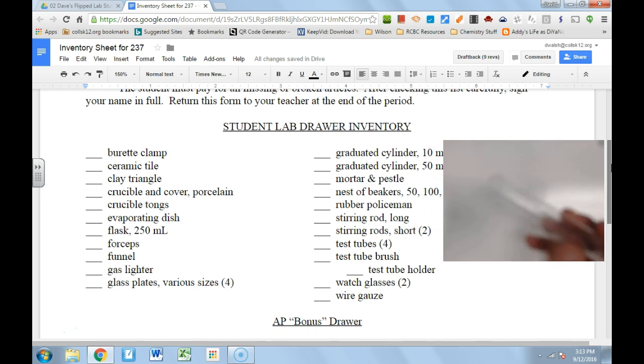These are test tubes — you guys probably know what a test tube is. They come in different sizes. This is the only piece of equipment you can intentionally break in our lab and not get charged for — there's actually a lab where you'll do an experiment that requires breaking a test tube on purpose.